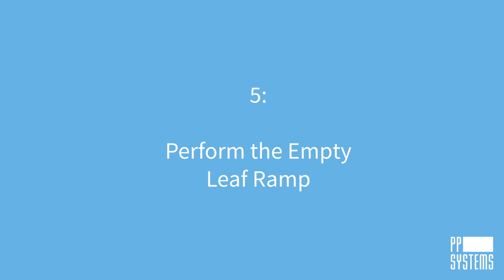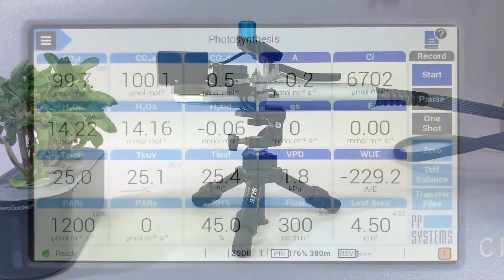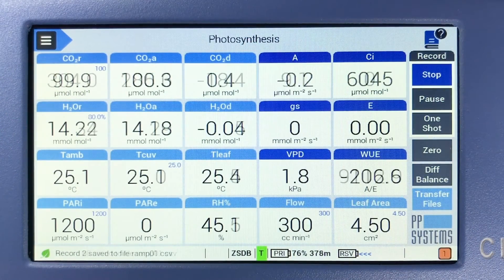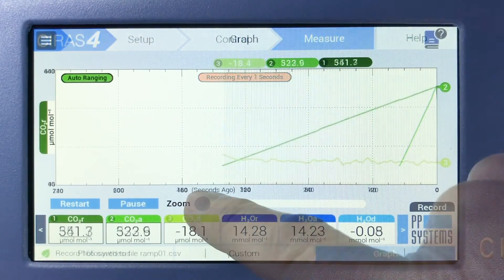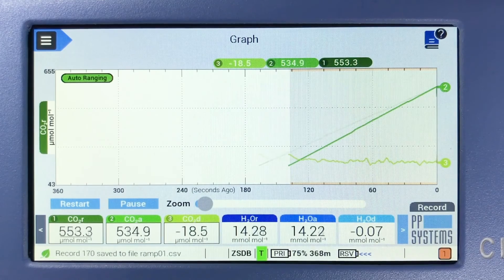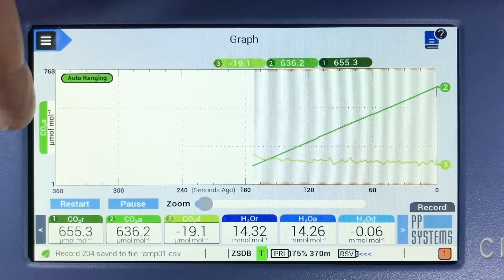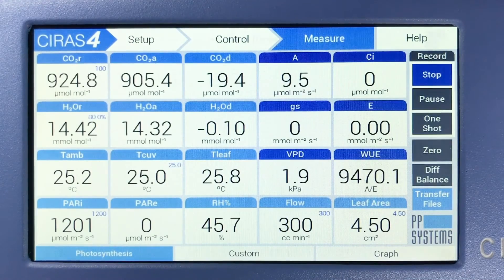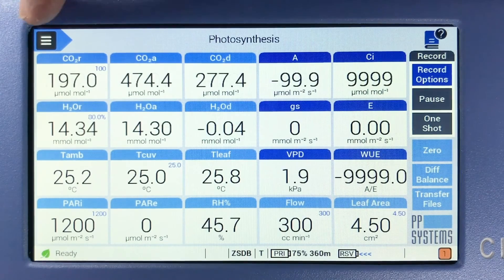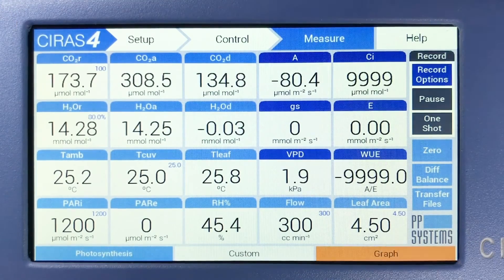Next, let's perform the empty leaf ramp. The first ramp recording creates the baseline trace to characterize the time response of the system and stores the data for subsequent post-processing. With a closed cuvette, tap Start on the command menu located to the right to begin the ramp experiment. Use Measure Graph or Measure Photosynthesis to switch between graph and tile views while the ramp is ongoing. Once the linear ramp is complete, an additional 30 seconds of data are recorded and the CO2 control will return to the initial lower limit.